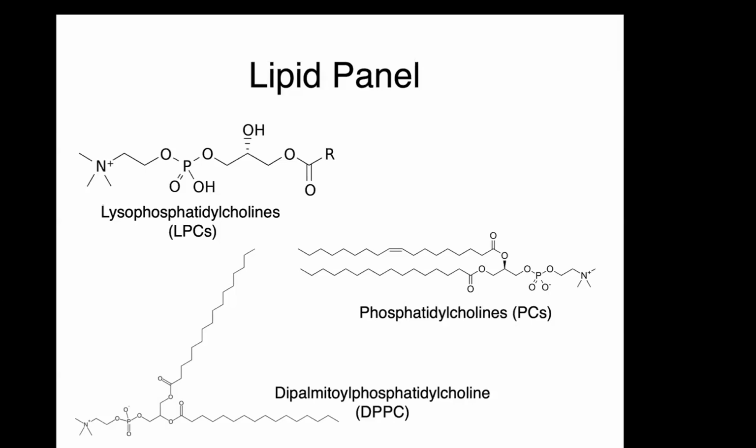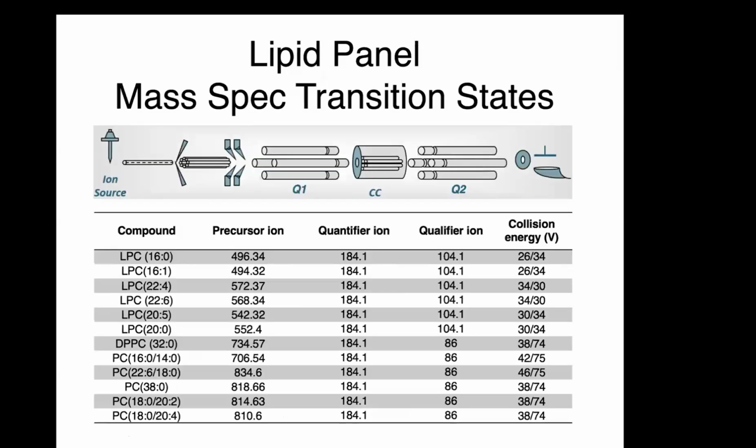But in Juliana's approaches with population metabolomics, she would be looking more broadly at classes or larger groups of compounds. This table, similar to the first one, is the MRMs for these half a dozen LPCs and PCs. But what you may notice, while they each have a unique precursor ion, we're looking at the same quantifier ion for all the compounds and then two sets of qualifier ions.